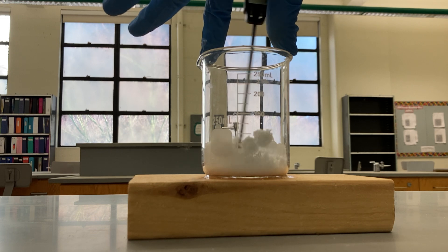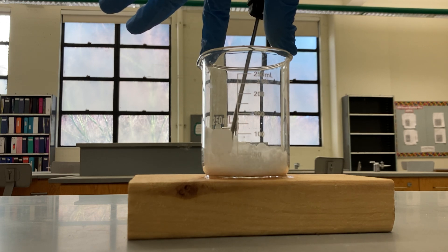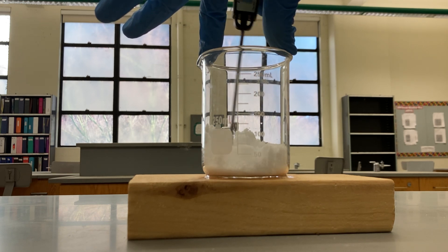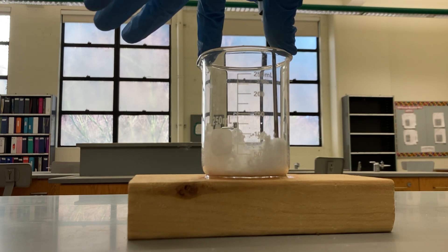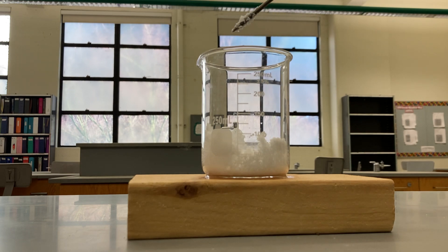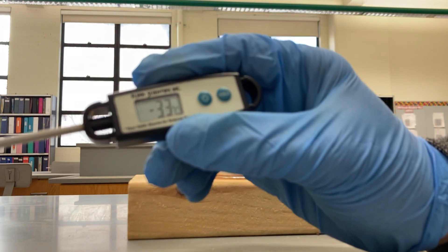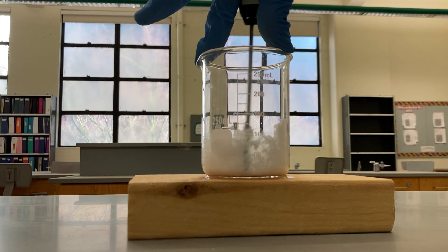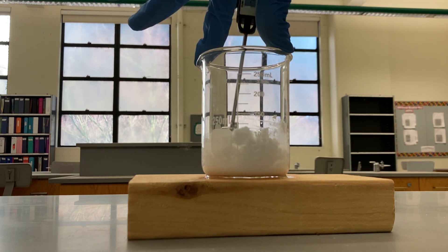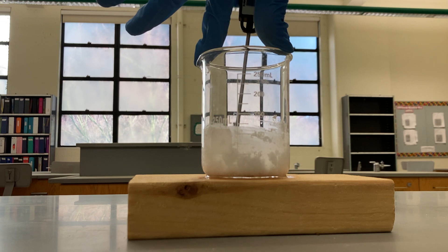Right away there's a very strong stinging scent coming off of this. As I'm stirring, I can actually see that the temperature on my thermometer is getting lower and lower — it's actually negative. Right now it's at negative three degrees. I'm going to keep stirring. You can see the pieces are starting to clump together a bit, and now it's turning into a kind of a slurry.